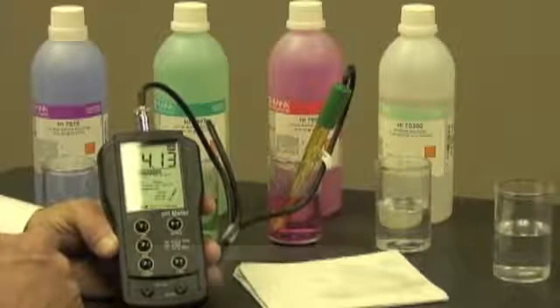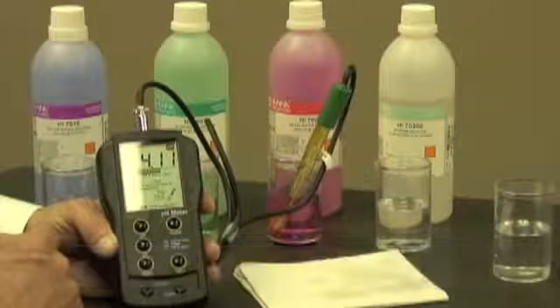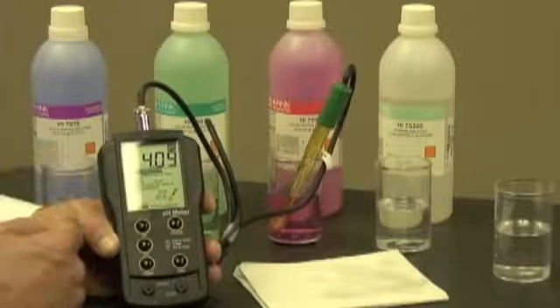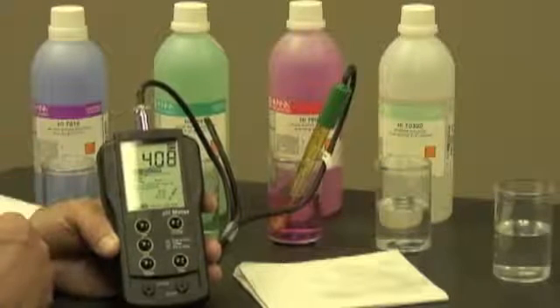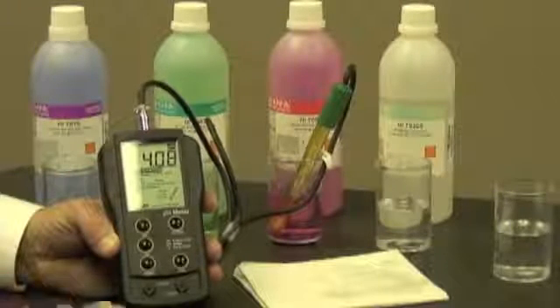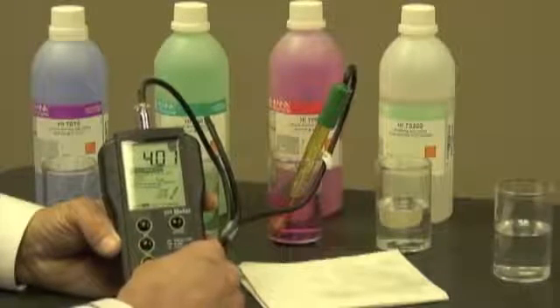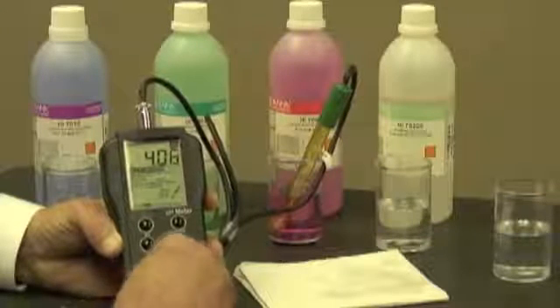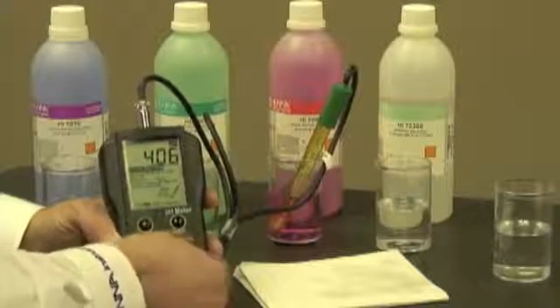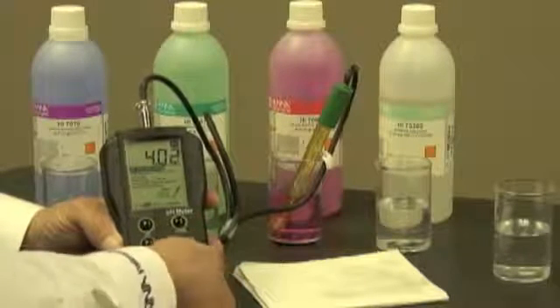I'll let it adjust. As you can see, the numbers are moving — now it's at 4.09, 4.10, hovering around those numbers. So it's time for me to make the adjustment using my coin, adjusting the slope trimmer down to 4.01.